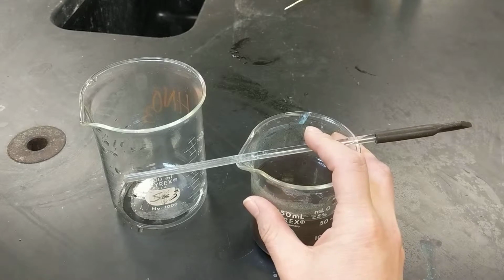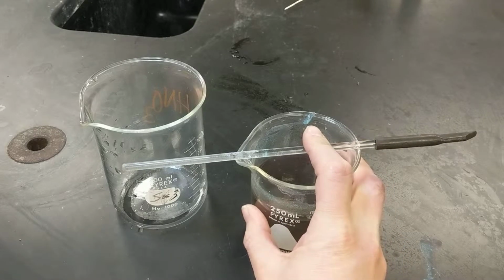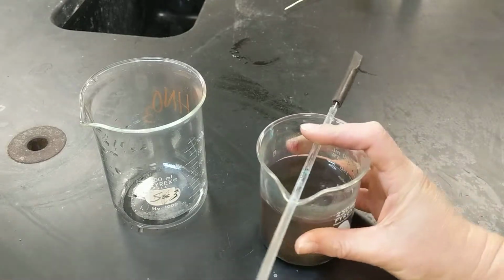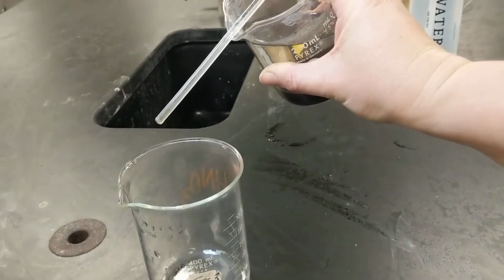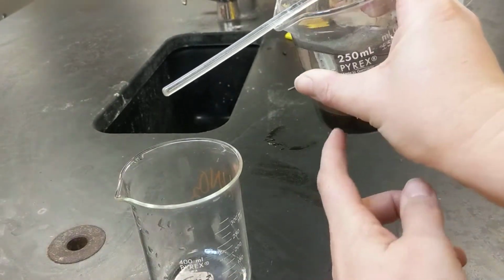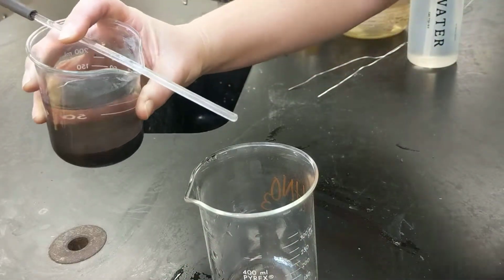So I'm going to pick up my beaker and hold the stir rod on the top and on either side, like this. And I'm going to tip it up, and my water is going to run down the stir rod and into the beaker, and my solid is going to stay at the bottom. So I'm going to flip over here so you can see me a little better.